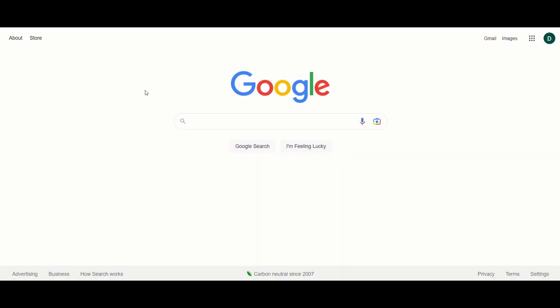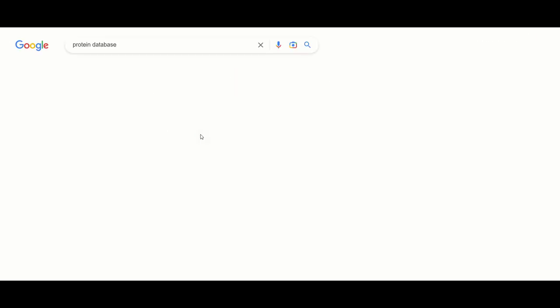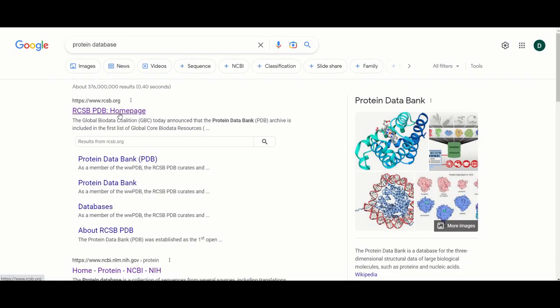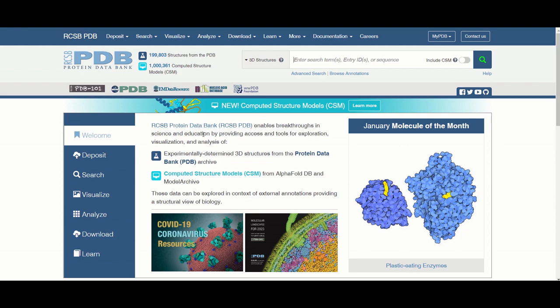So there are a number of places where you can download proteins. One of the best in my opinion is if you go to Google and look up protein database and then go to the first link here. Here you can pretty much look up any crystal structure you want from any protein.